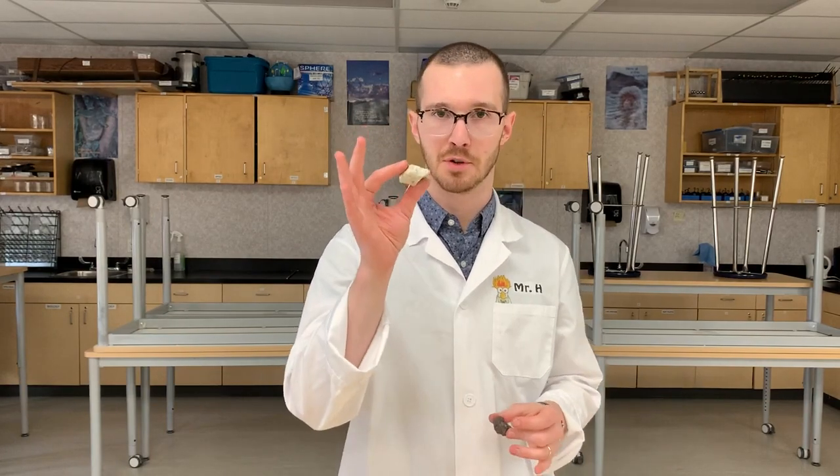So with those things in mind, I want you to take a look at the mineral identification chart attached to the instructions and see if you can determine the name of each of these samples, sample number 1 and sample number 2. I'll tell you these at the end of the week. There's no right or wrong answer for your guess, but I need you to establish which mineral you think it is based on the observations that we just made.